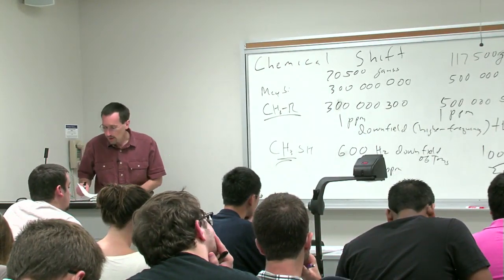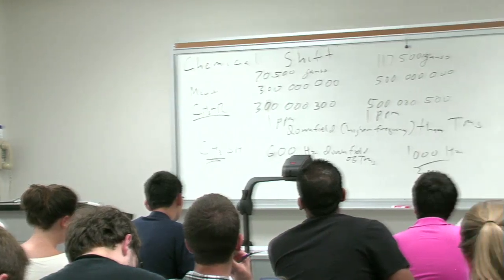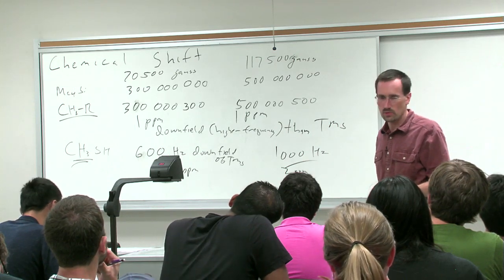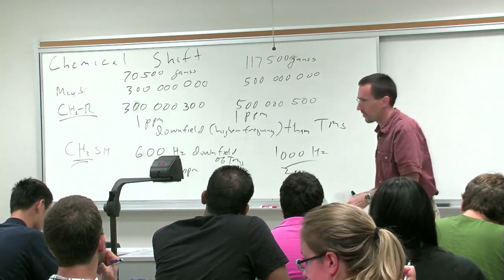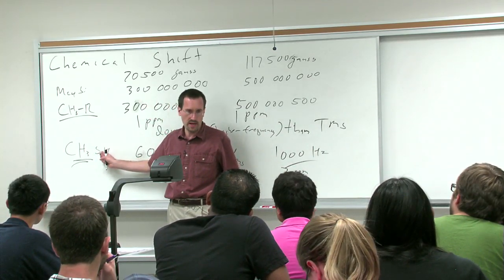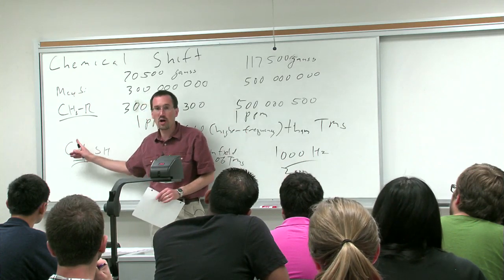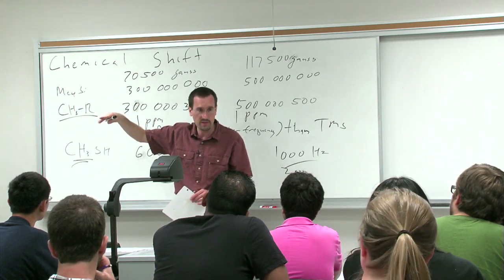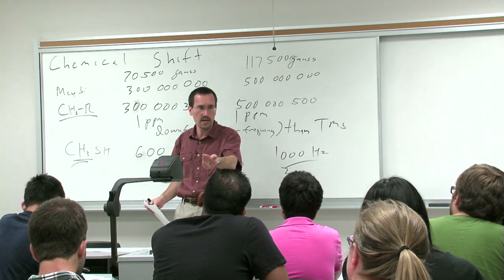All right. Chemical shift depends on the electronic environment that the protons are in. And this was what the physicists were so upset about, and why they gave it this contemptuous name. If you have an element that pulls electron density away from the proton, for example sulfur, which is a little bit electronegative relative to carbon, then the hydrogens, which are shielded by the electron cloud around them, since the electrons oppose the applied magnetic field, have less electron density, and so they feel a stronger magnetic field and hence resonate at a higher frequency.